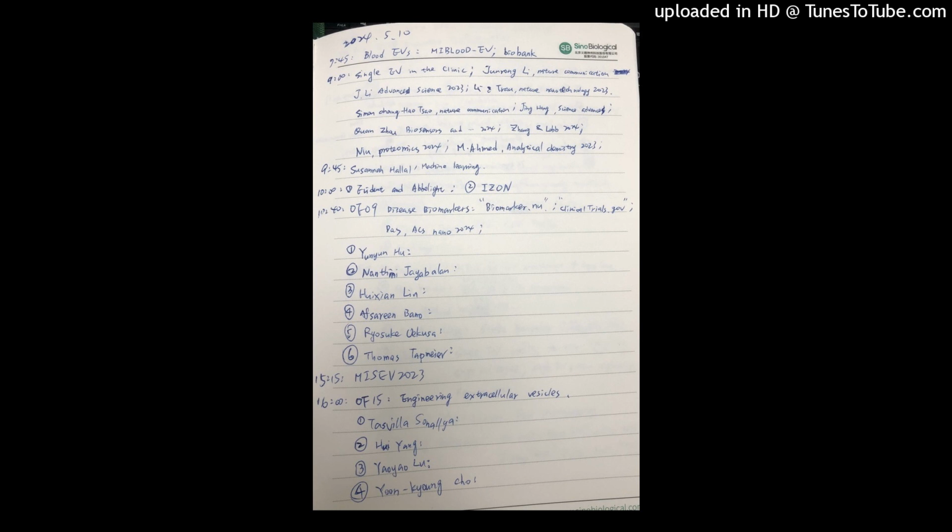I don't care, nobody cares whether you have platelets still in your plasma. That's your problem. But I would like that if you report your data, you also report that there are still vesicles, still platelets present in the plasma, and if you can report the concentration, that would be very helpful. Because what happens now is that everybody measures nothing, so we have no clue.